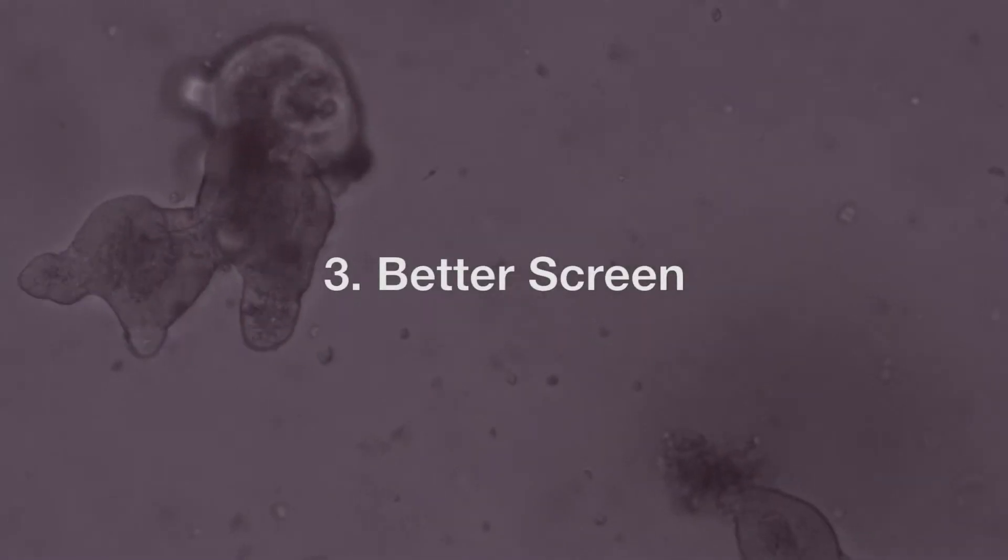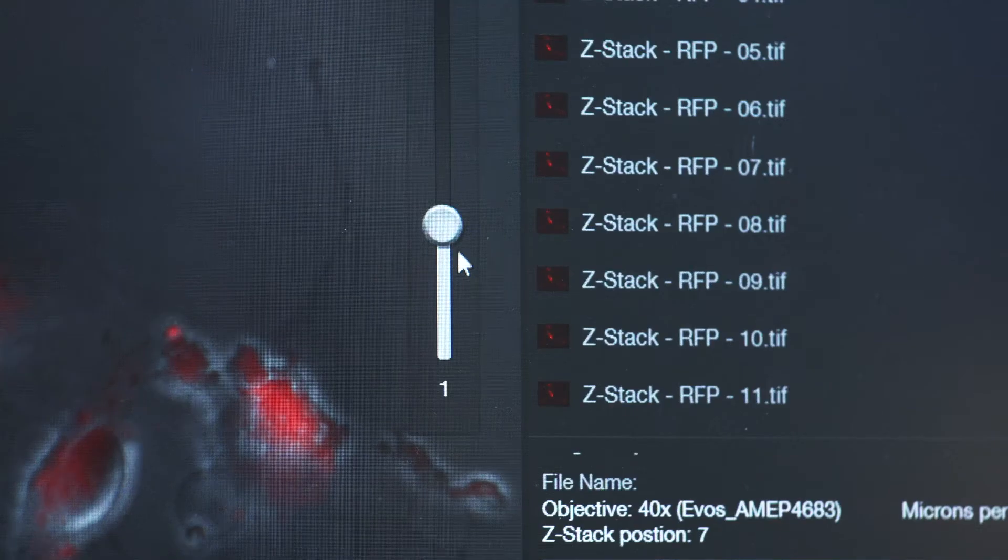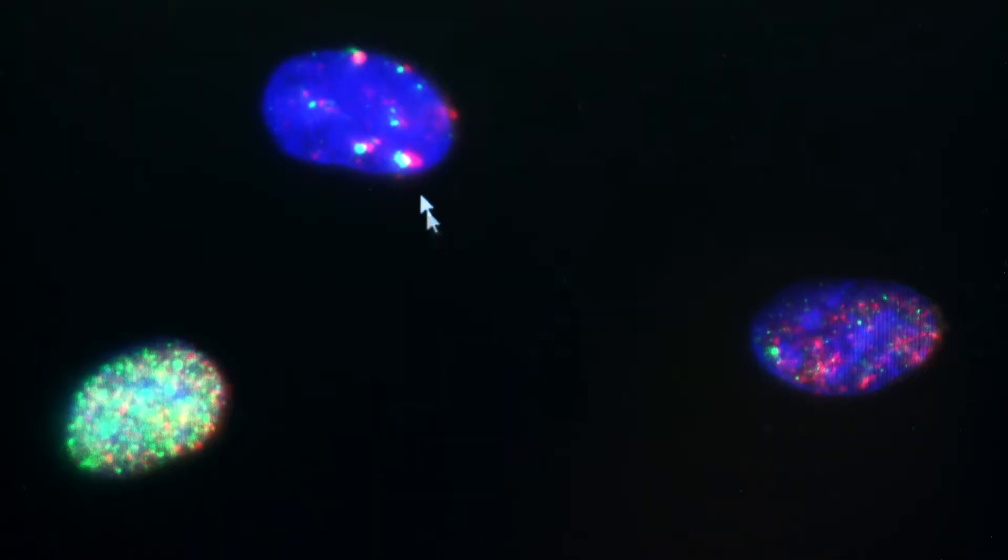Big difference between the old system and the new system. The new system has a way nicer screen. By now I actually almost prefer it for, for example, cell counting because you have everything on a nice big screen. You can just count each individual cell quite quickly with your counter instead of always looking through the eyepiece.